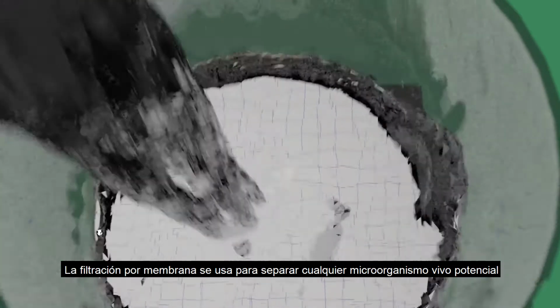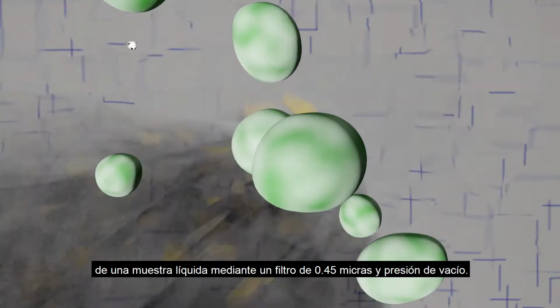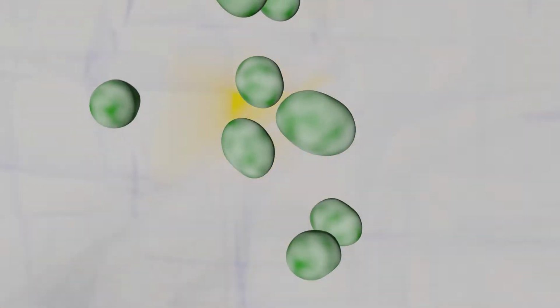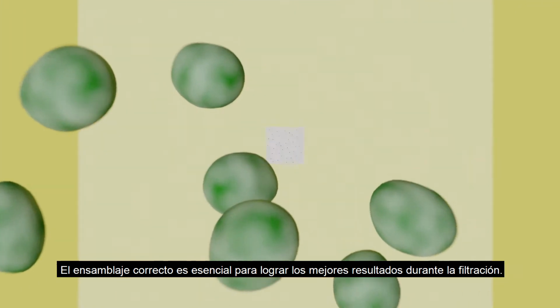Membrane filtration is used to separate any potential living microorganisms from a liquid sample through the use of a 0.45 micron filter and vacuum pressure. Correct assembly is essential to achieve the best results during filtration.